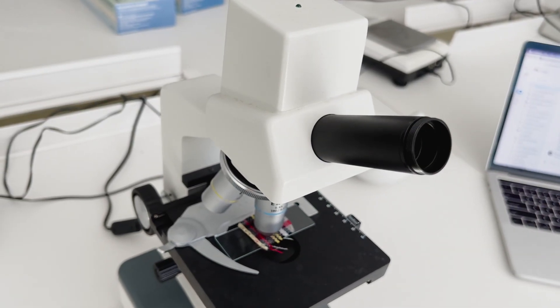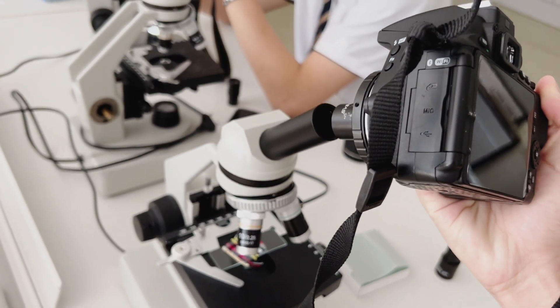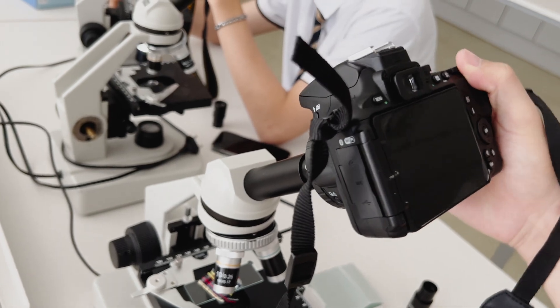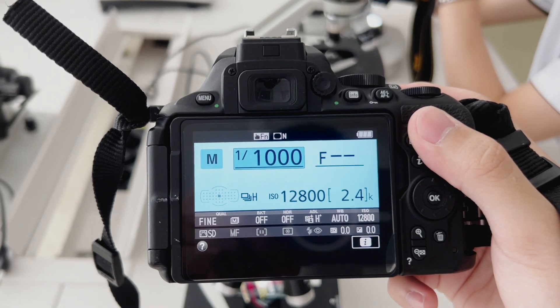Next, remove the microscope's default eyepiece and fit the camera's adapter neatly into the microscope. Set the camera to manual mode and photograph the magnified image of the microscope.